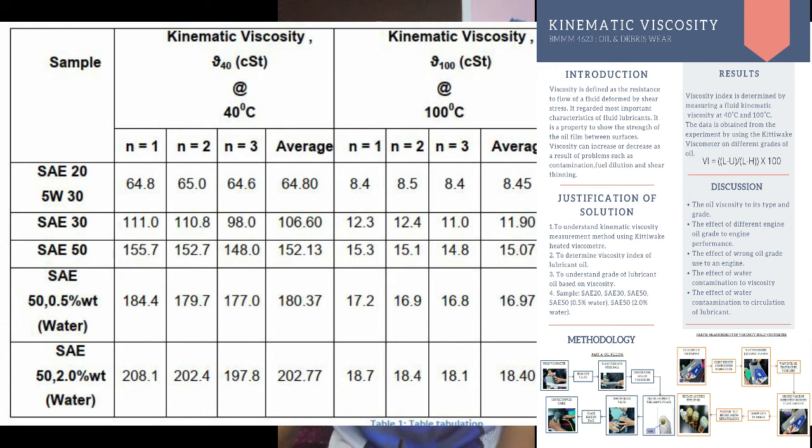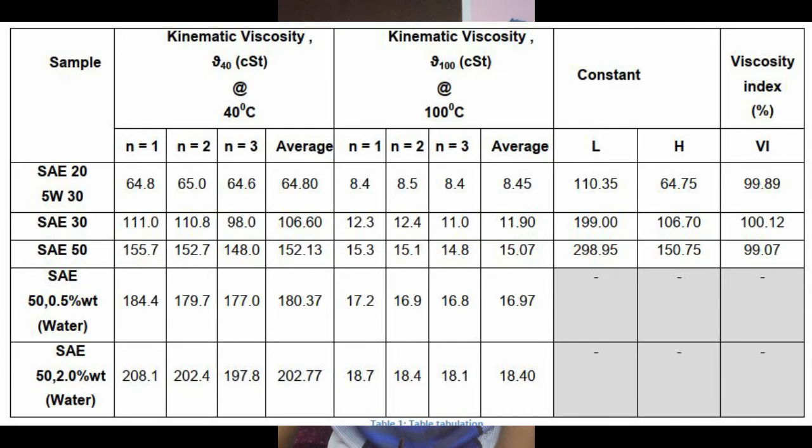We have 5 samples. First, SAE 20W-30. Second, SAE 30. Third, SAE 50. Fourth, SAE 50 with 0.5% water, and last but not least, SAE 50 with 2.0% water.